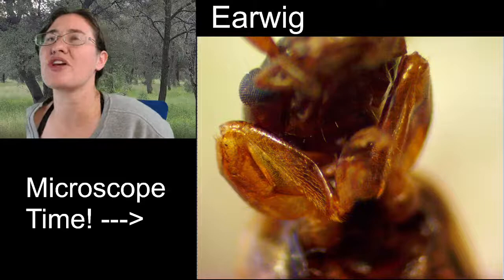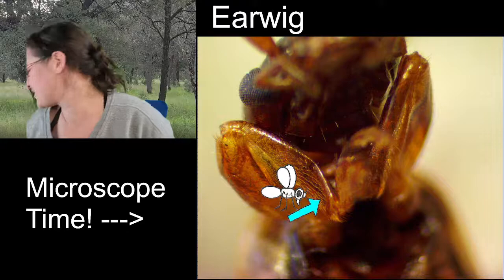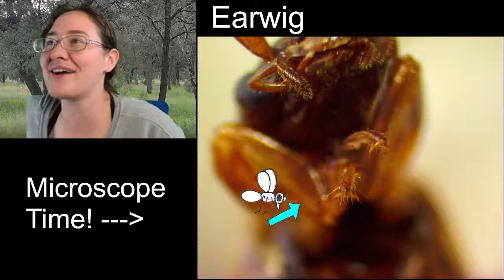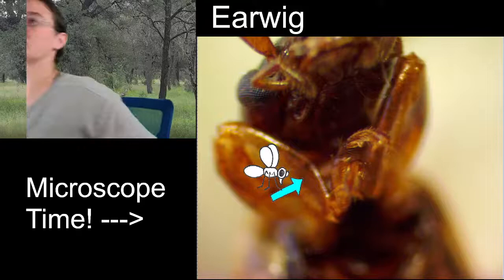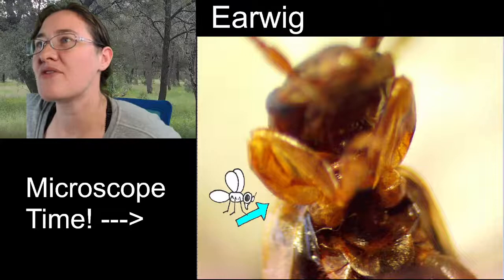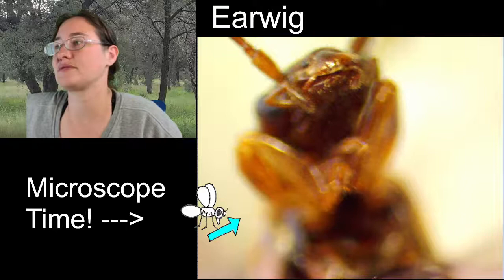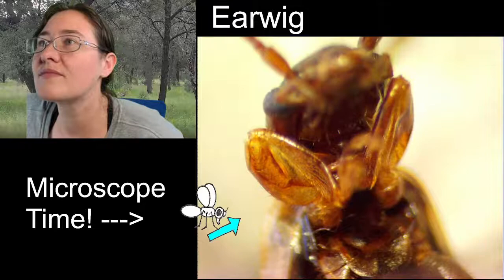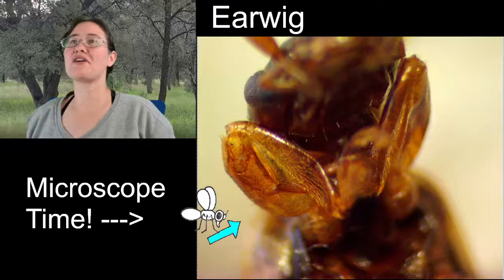Decent look at a leg here, and the legs are being a little bit difficult, but this right here is your femur, this here is the tibia, and the tarsal segments are going to be right here in this region, right there. You can see the last kind of tarsal claw right up here. I was hoping to find a better look at this leg. Good texture on that tibia. Cool. All right. I'm going to give you guys a moment to check that out.